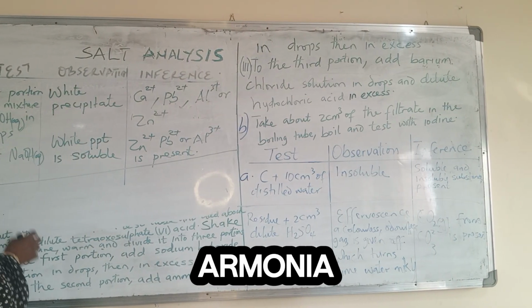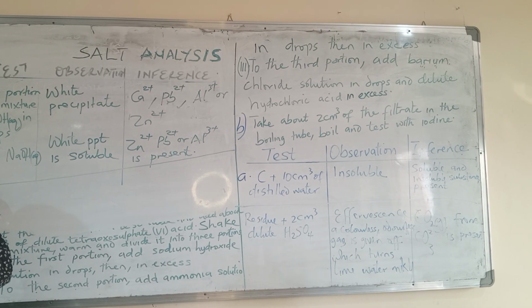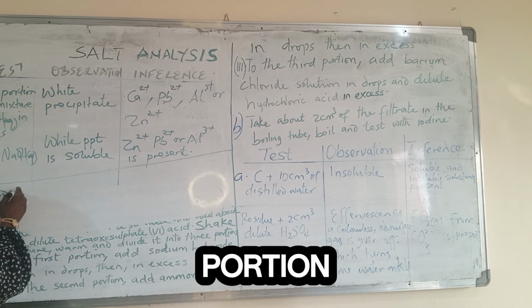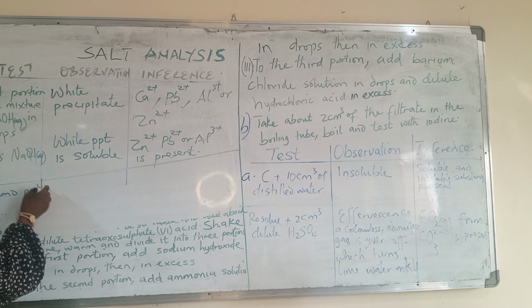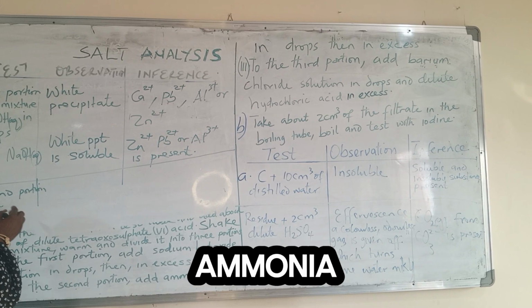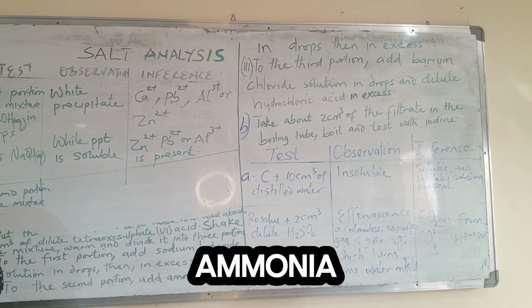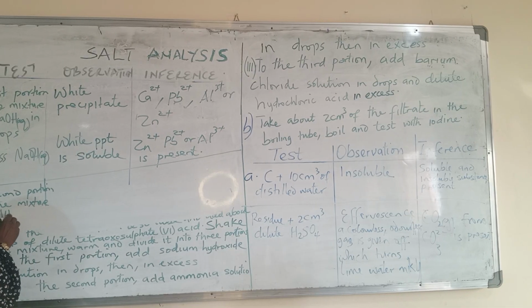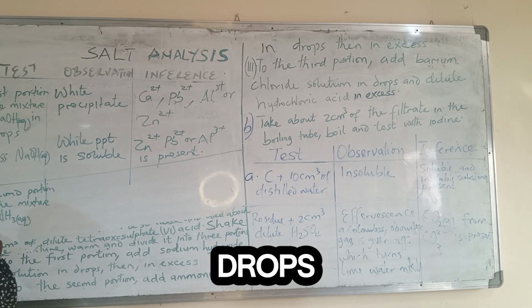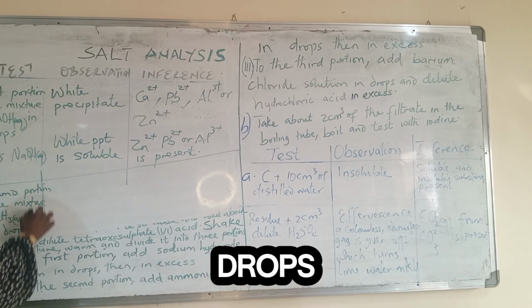You now add ammonia solution to the second portion of the mixture, aqueous ammonia, the first one in drops.